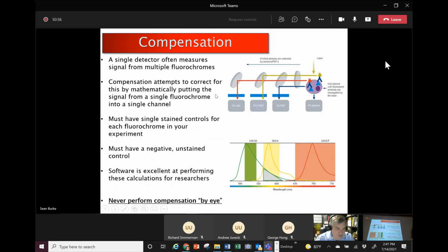So I'm going to move on here. There's this concept in flow cytometry called compensation. Honestly, I think I'm going to skip over it here in the interest of time. But what happens is, if you're using one of these smaller, handheld systems that just has 1 or 2 detectors in the system, the light just goes into the correct channel and you make a measurement.